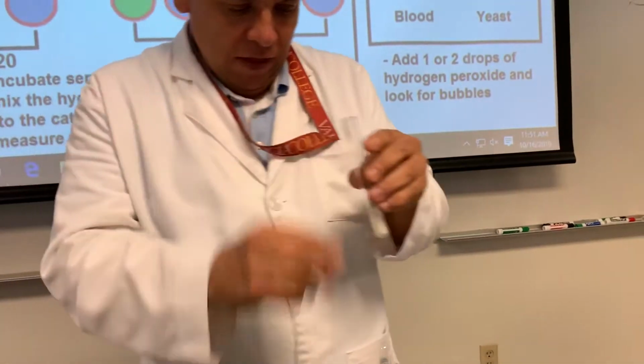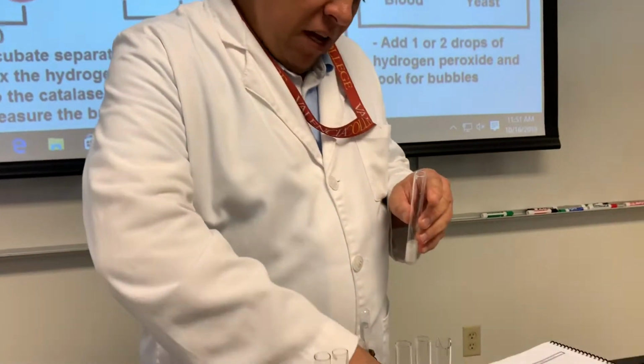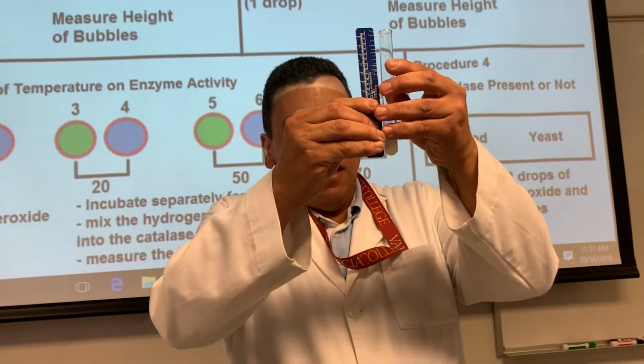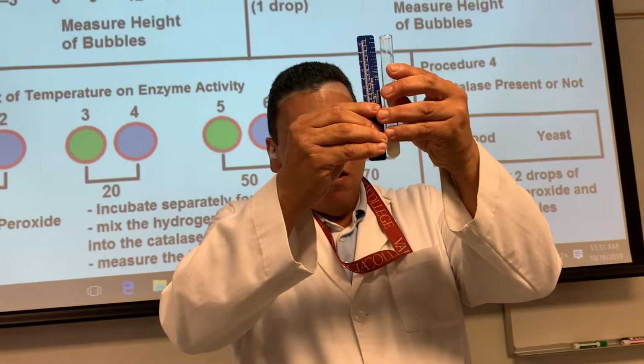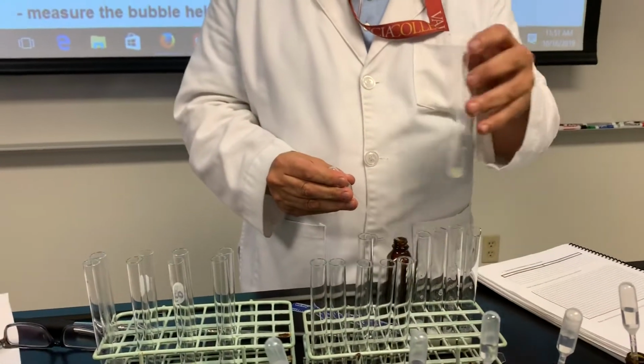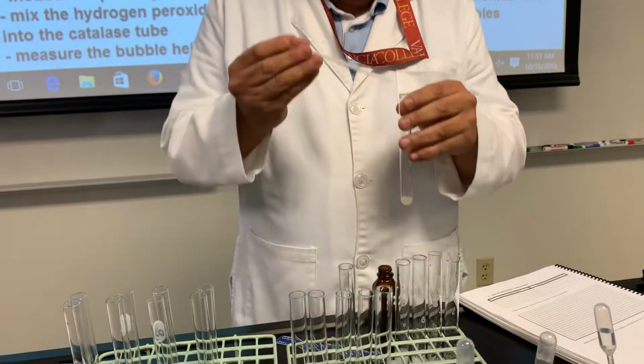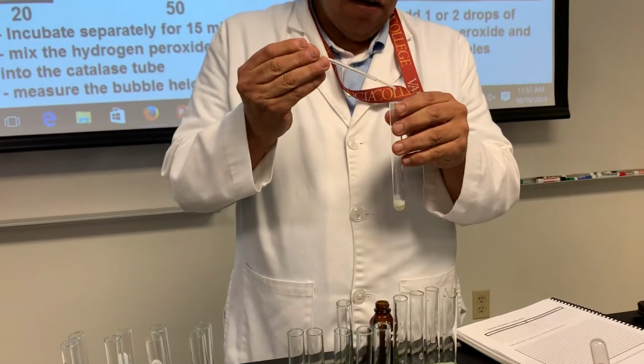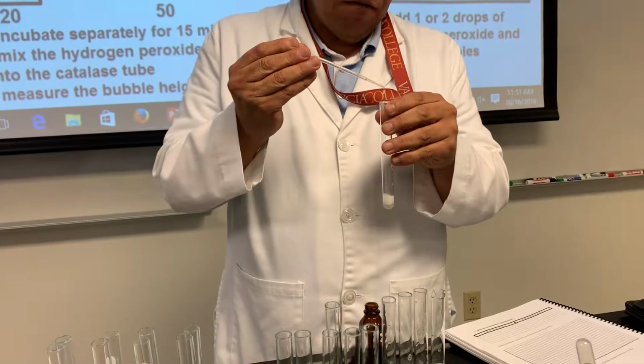Is this exponential growth? No, it's not going to be like that actually. It's going to taper off, hopefully. Let's see. 38. Oh, now let's go down. No, the previous one was lower than that. Make sure you're writing the correct numbers. I expected it to go like a 40 or so. Well, hang on. 2, 3, 4, 5, 6, 7, 8, 9, 10, 11, 12, 13, 14, 15.